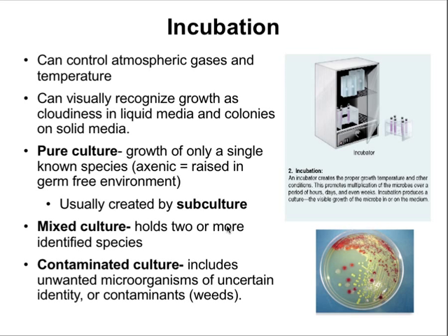The growth of cultures is sort of analogous to gardening. We're seeding tiny little pots with cultures. Then we'll collect the cultures, or the plants we're interested in, off that one media and grow them again on another media. In this way, we can exclude contaminants or other cultures that we're not interested in observing. The incubation periods can last from a day to several weeks.